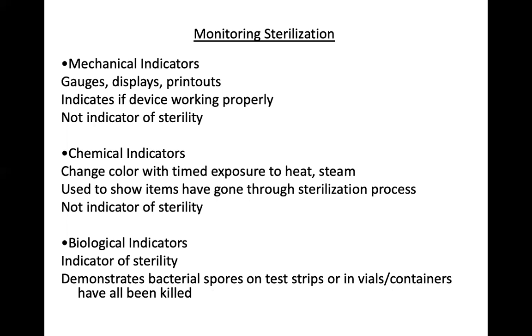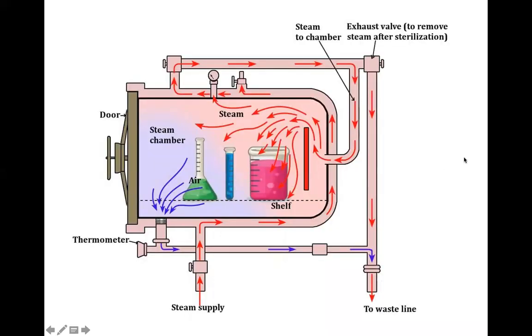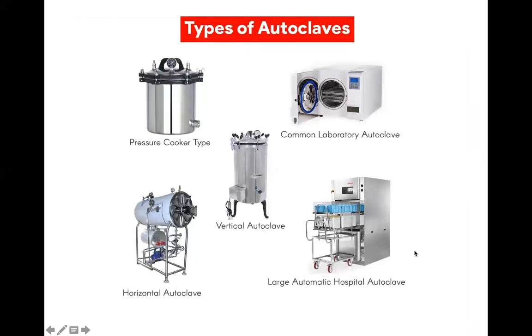Now for certain high level labs, like level 3, level 4 labs, where you're trying to decontaminate things before they exit the lab, those are the kind of labs that have these large scale autoclaves. For those labs, things don't leave the lab through the door. They get out through the autoclave. For you, the human being, you will exit through the door, but you will go through a shower. The entry door is different from the exit door. And that exit door has a room where you get rid of all the clothes you have put on, you leave them there, then you go into a shower, you bathe from top to bottom, then you exit where you can put on your street clothes.